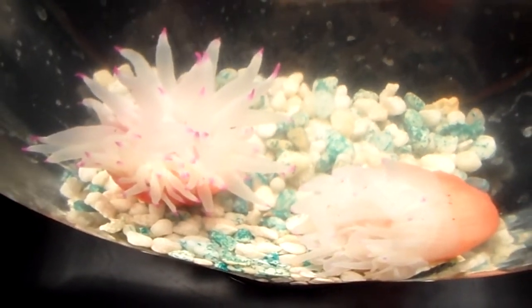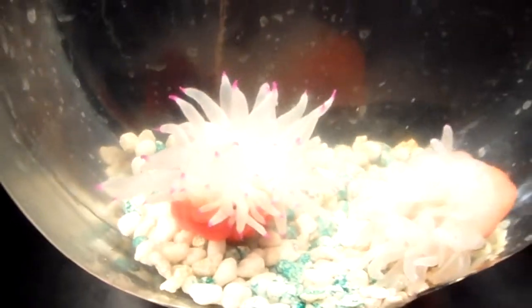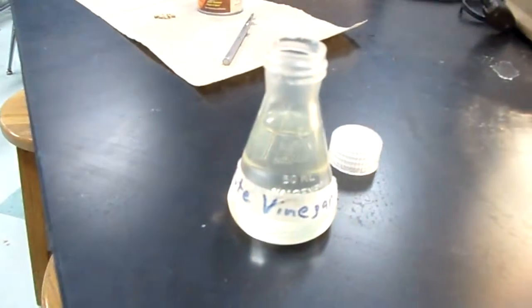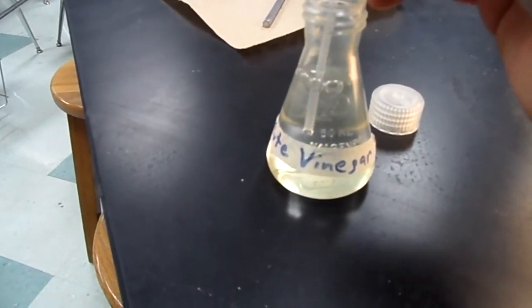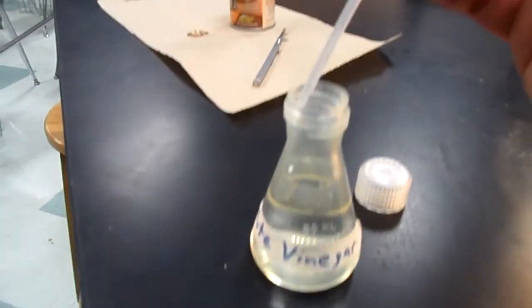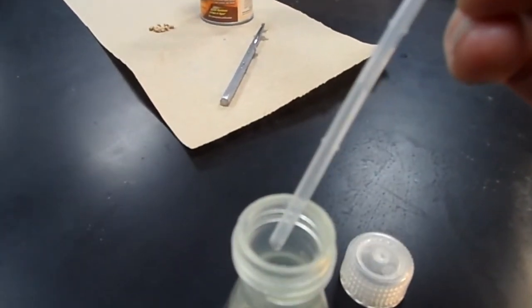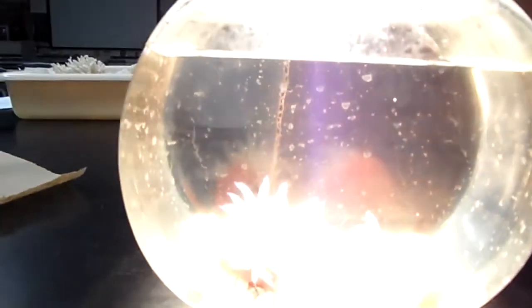So our final experiment is whether or not anemones can sense light, or can smell. And for that, I plan to use the dilute vinegar. Dilute, sorry about that view. Dilute meaning that it is watered down quite a bit. And I only need a little bit. So if you can see what's in the tube there, there's not much, because I don't want to put too much on.